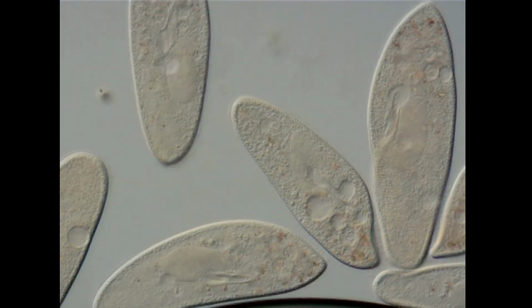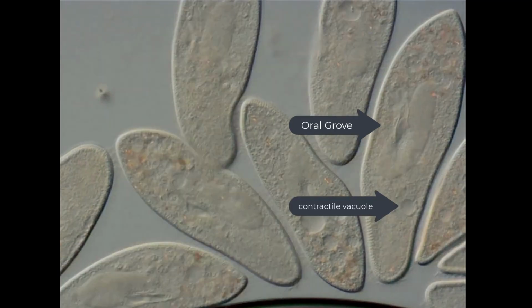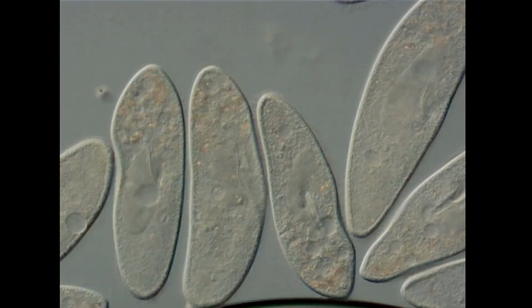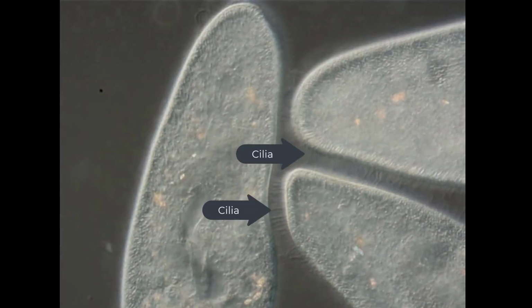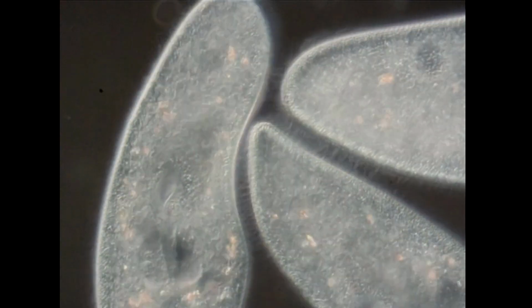And you can also see their mouth parts and the contractile vacuoles so that they keep their homeostasis intact. There's also food vacuoles that move inside. You can see the nucleus, and yeah, really fun to watch, and they're great. And I hope you see lots of different organisms.